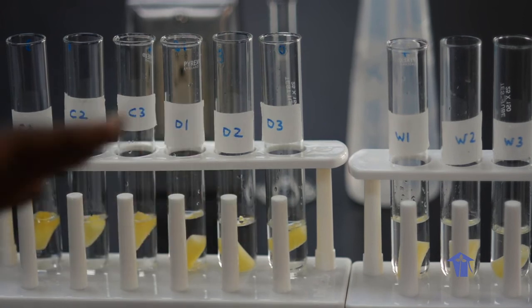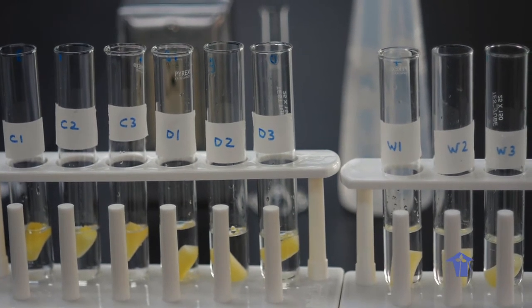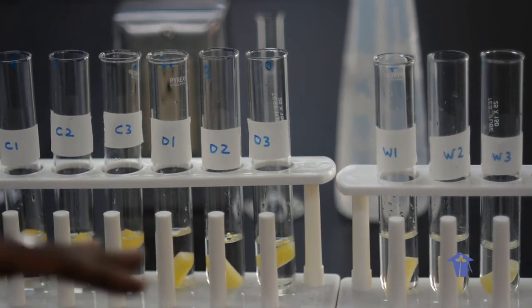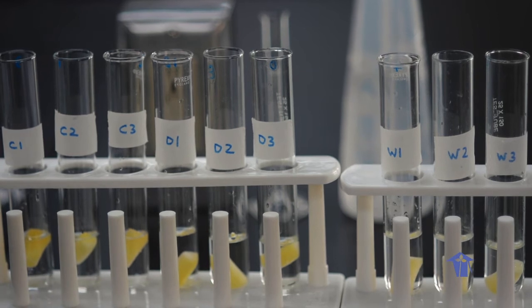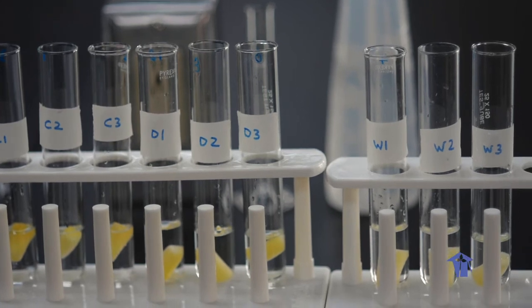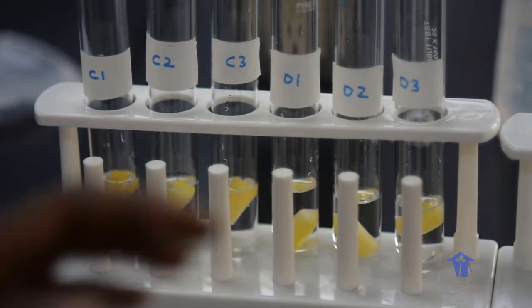So what we aim to do, having put our potato strips into tubes containing different concentrations of solution, is to see whether there's going to be any difference in the end point. When we come back and do our measurements, we should be able to see whether our potato strips have grown larger, or shrunk a little bit, or remained the same size. And that will enable us to make some sort of concluding statement about osmosis taking place with our potato in these different solutions.